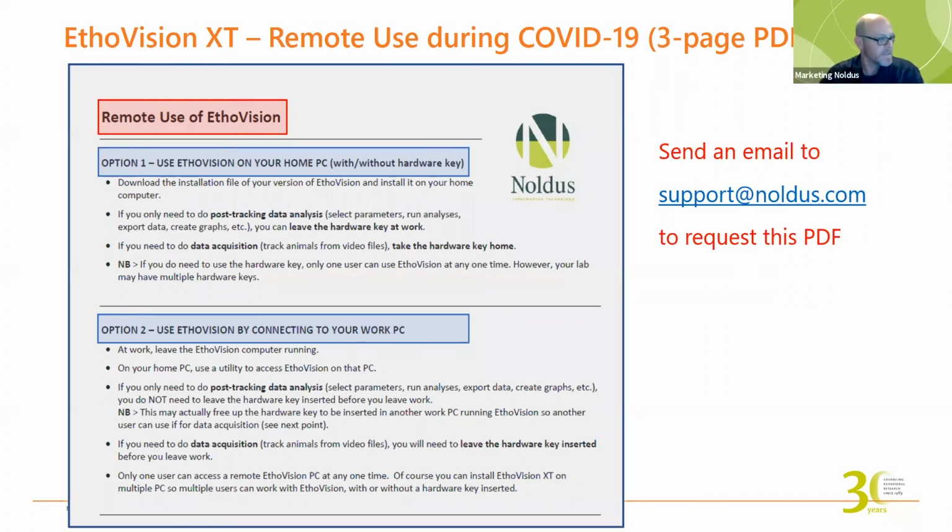Okay, a couple more questions. We just upgraded to version 15, but we kept our black and white camera. What would be the value of upgrading the camera?